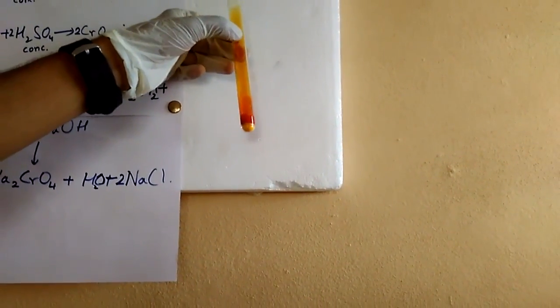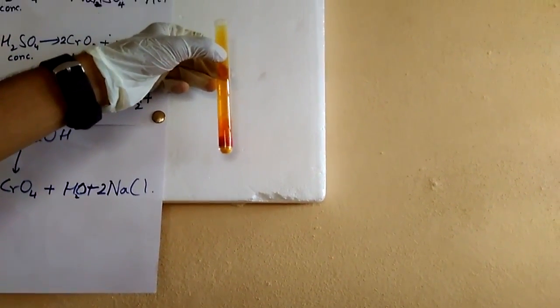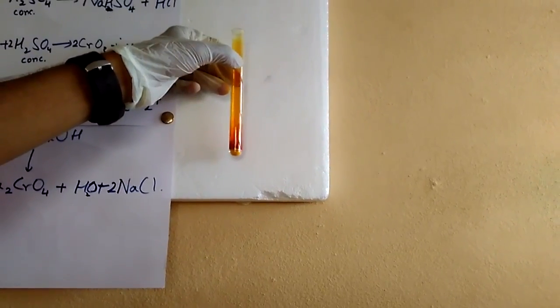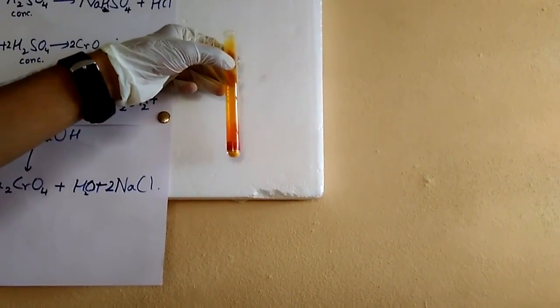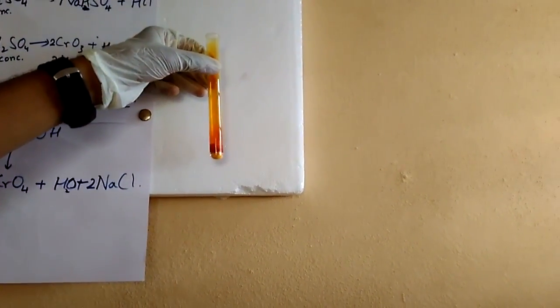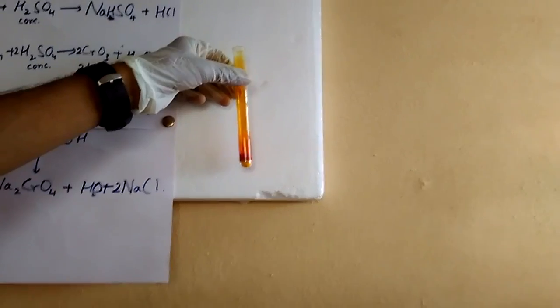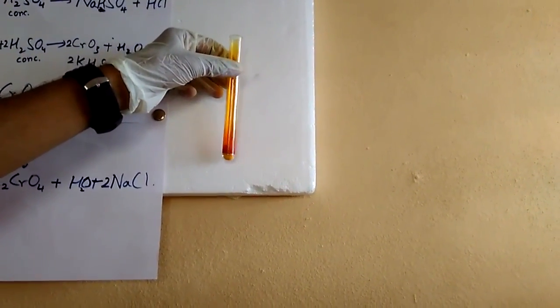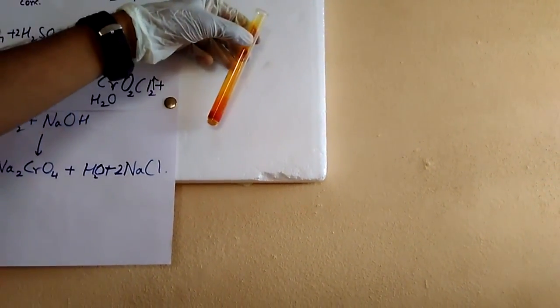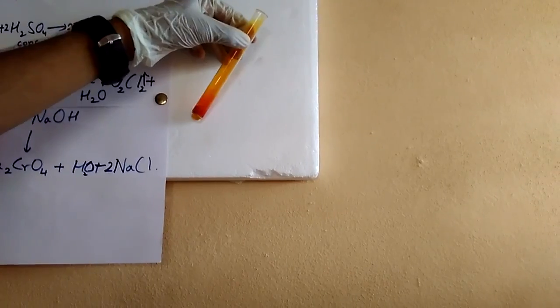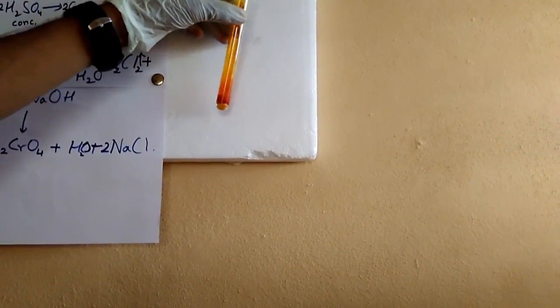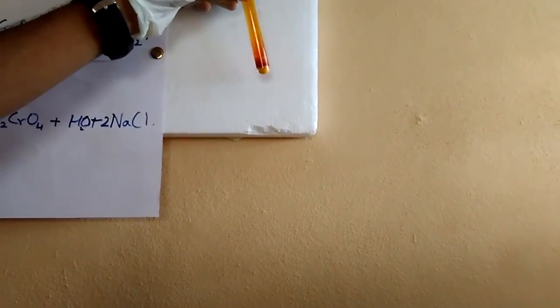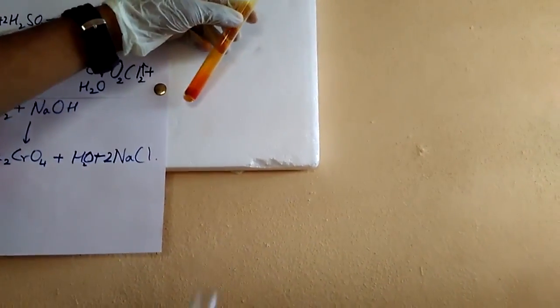This reaction is basically carried out at 117 degrees Celsius. Unfortunately, I could not get that temperature accurately, but fortunately the reaction goes well at room temperature too.